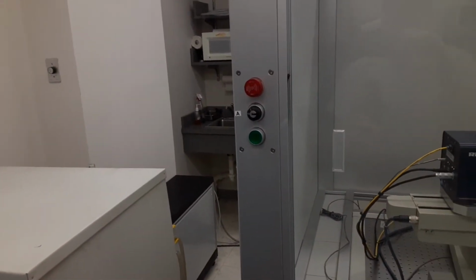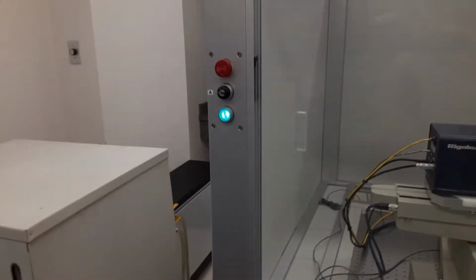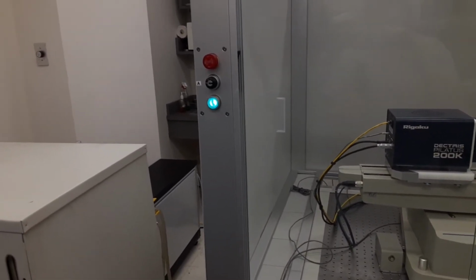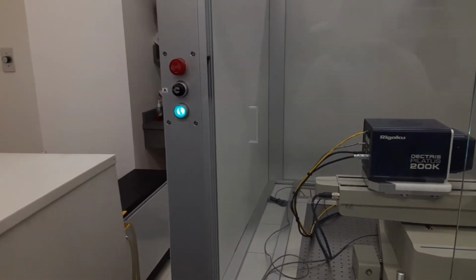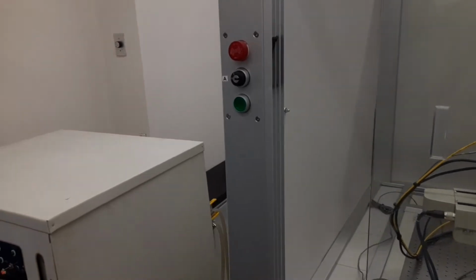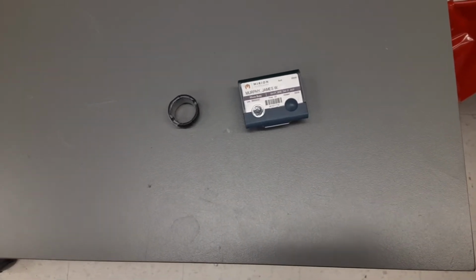Once the doors are shut, I can press this button and this light will turn green. Once that light is green, that indicates that the doors are shut and that the user can use the computer to open the shutter to allow the X-rays to come out of the tube tower. Only if the door is shut can you do that. So if I were to open the door during the experiment, you would see the light would go off and the shutter would be closed. That's to prevent accidental exposure. And the third safety device is that all users have to wear the dosimetry badge to monitor any accidental exposure.